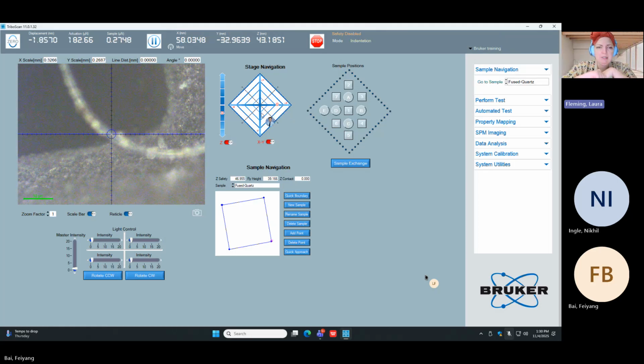The last is our tip to optic calibration, correct? I'm sorry, is that a question or are you just rephrasing what we did yesterday? It's me asking the questions of those five steps. Is our hardware installed? Yes. Did we do our daily indentation axis calibration? Yes. Did we define our sample zones? Yes. The next question is, is your tip to optic calibration accurate? No. Yesterday when we did that, I think it's crushed. I don't know whether you guys reached that far. Yeah, me either. The actual answer for me is I don't know, which means we have to redo it.